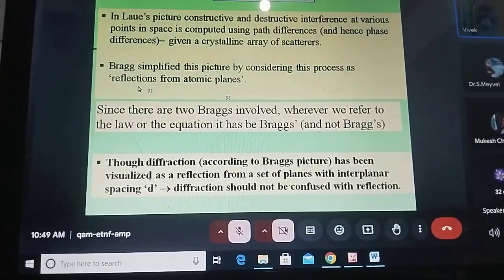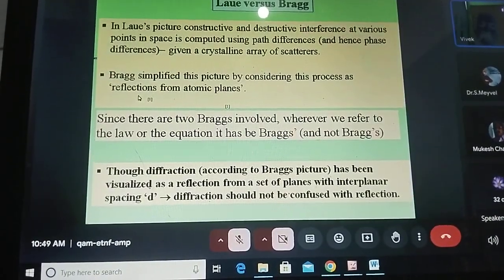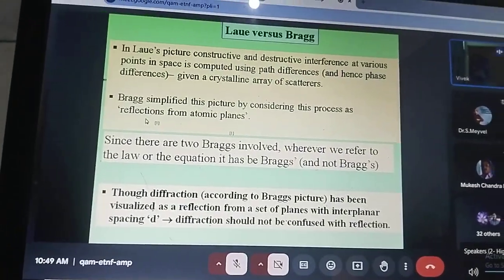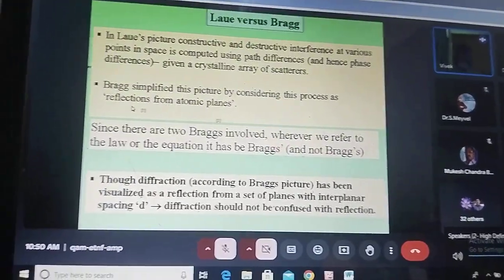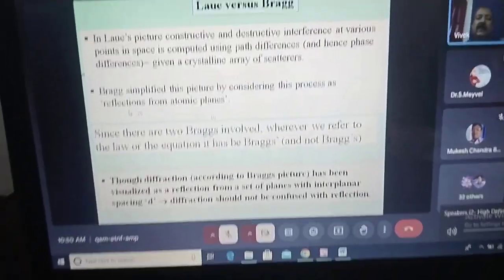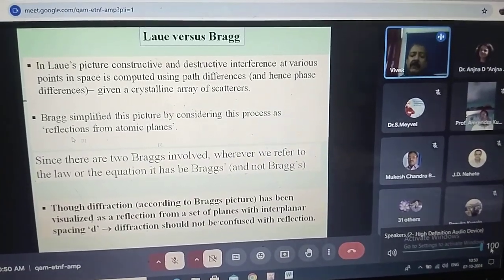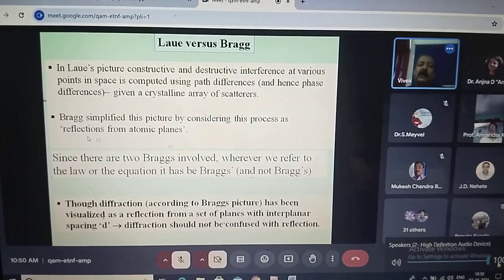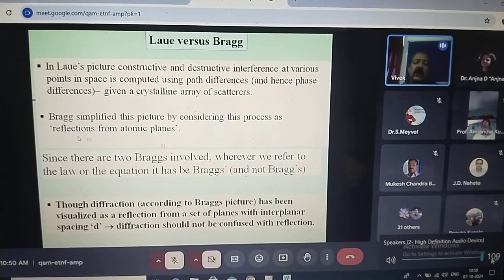From analysis of the data I can make out whether all reflections are present, whether even reflections are present, whether the 120 reflection is present, 130 not present, like that. From that I will make some points: HKL, H even present, K even present, L even present, or HKL all absent, H plus K: 110 present, 120 absent.